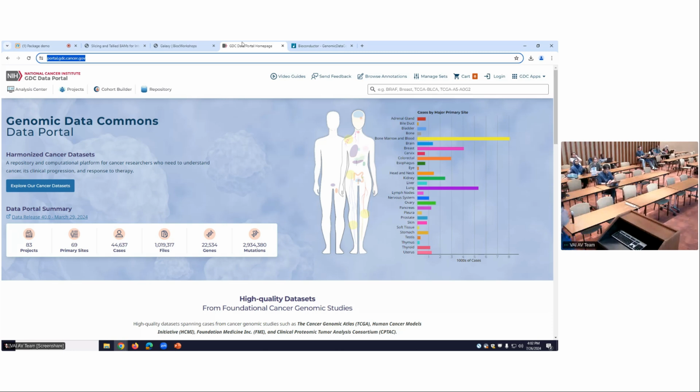It also offers a vast collection of clinical and genomic data from patients from large translational consortiums like TCGA and TARGET, with all types of cancer. And it provides high performance data acquiring and sharing infrastructure that allows the community to access the data.